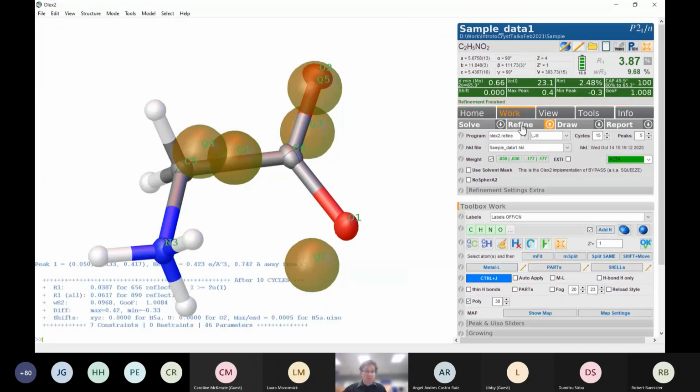Okay. And we can keep that. As I say, at this stage, when we're doing the refinement cycles, you'll notice that my R1 is not changing. Everything else up here isn't changing. But each time you make a change, it is best to run the refinement cycle so that everything is as you expect it to be, the sample, the data, and so on.